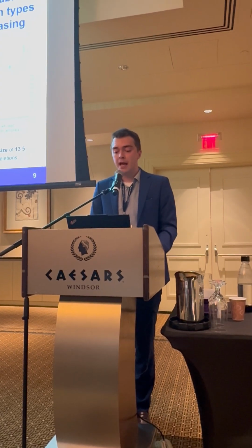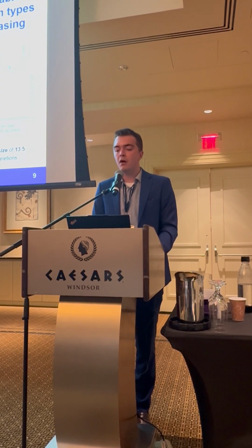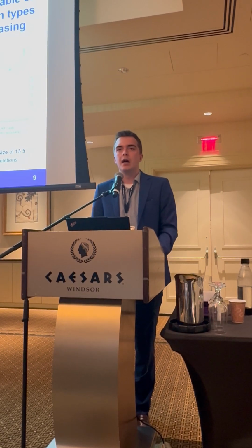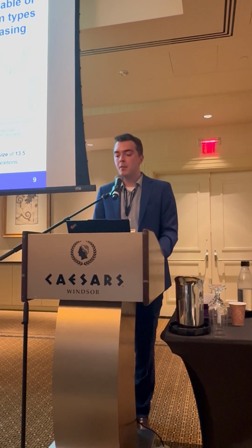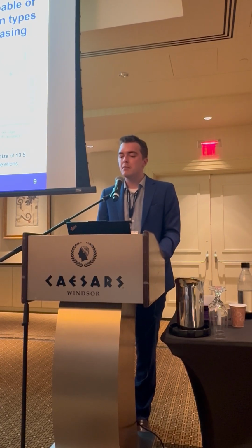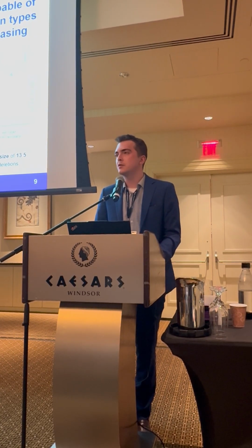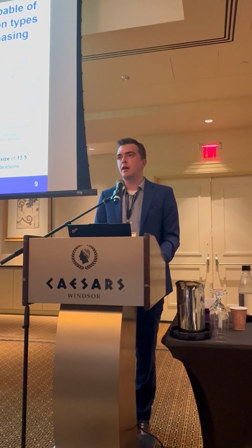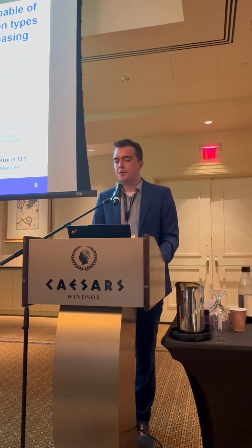This technology provides many advantages, including the identification of all types of mutations, including SNVs, indels, and SVs, as well as measuring epigenetic modifications in a large read. This large read also allows for same-molecule haplotype phasing of variants, so we're able to tell when multiple variants are occurring on the same read and see their chromosomal origin, paternal or maternal.